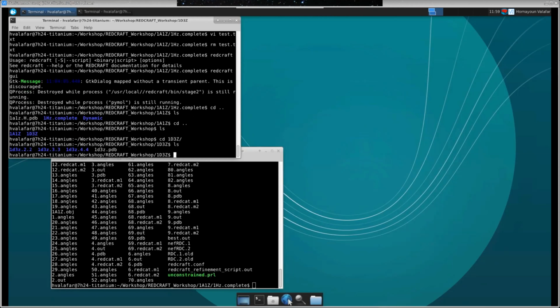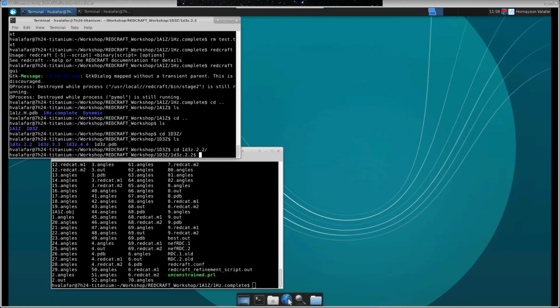I have 1D3Z.4.4. This indicates that I have up to, but not always, up to 4 RDCs per residue from alignment medium 1 and 4 from alignment medium 2. Then I reduce it to 3.3, then I reduce it to 2.2. And I suspect you guys want to see, I don't know which one you want to see, you can pick one. I would assume the less the better.